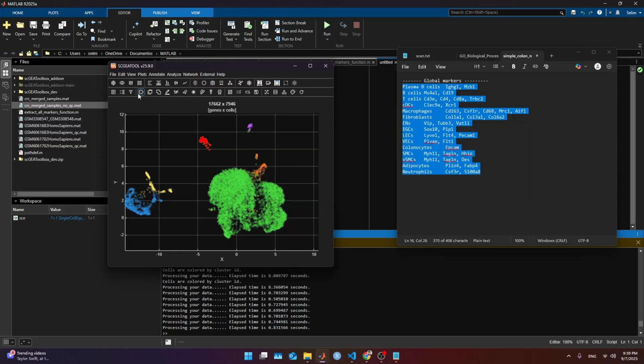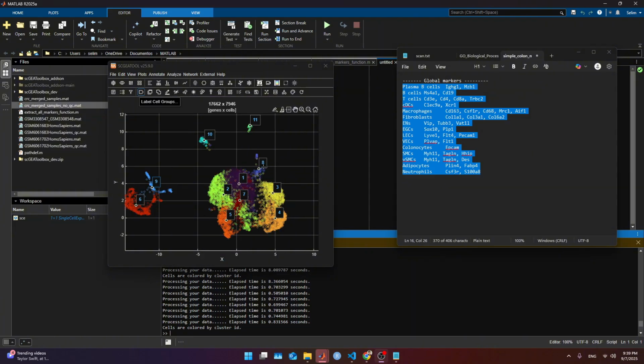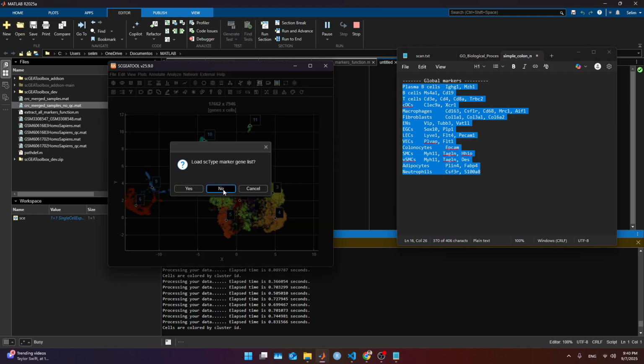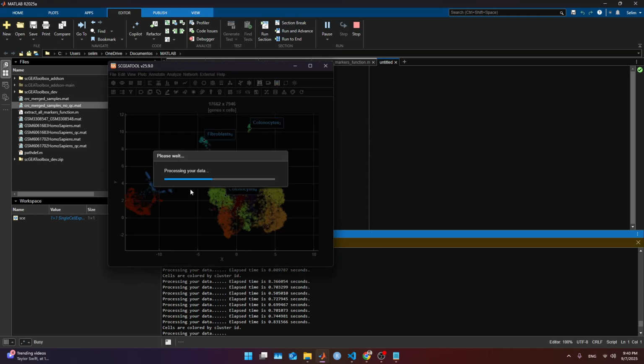We have to select first what we want to assess the markers over. So we gotta do it over the clusters because it's gonna score that community only. Then we select again and copy, and then we annotate, customize, no, and then do it again and just automatically.